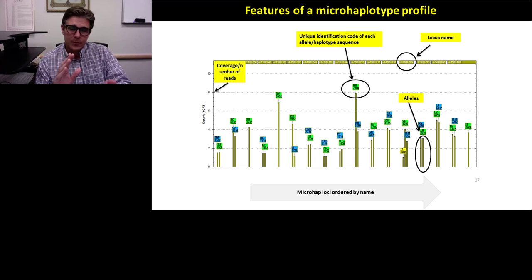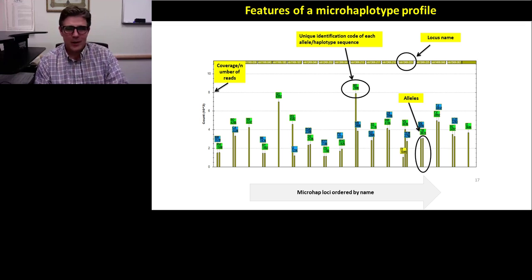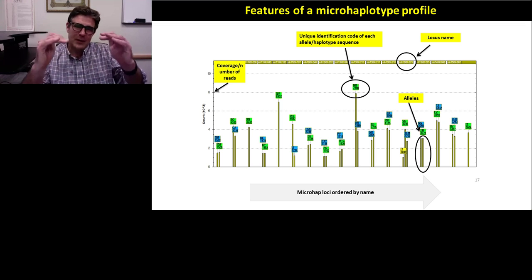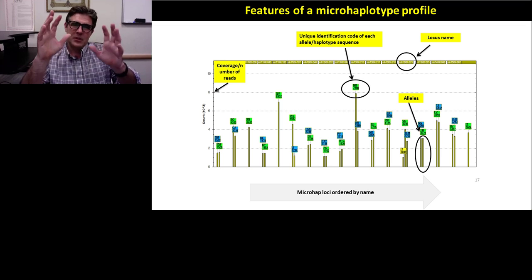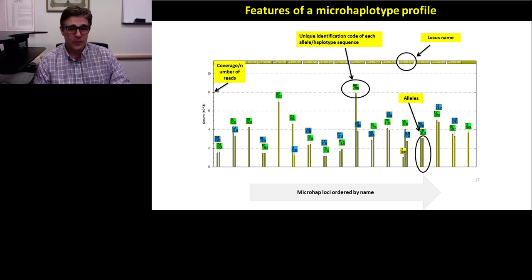So we have to optimize the pipeline in order to clean better and to identify which ones are the actual alleles. And you see a couple of those also. Also, that's more kind of a PCR primer concentration issue. We want to try to balance all the different loci, so that the coverage is similar across the loci.